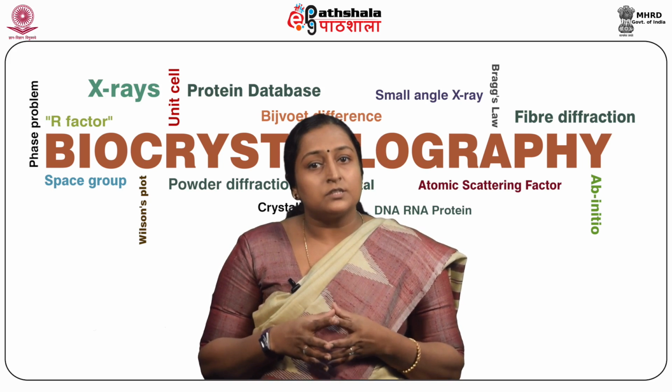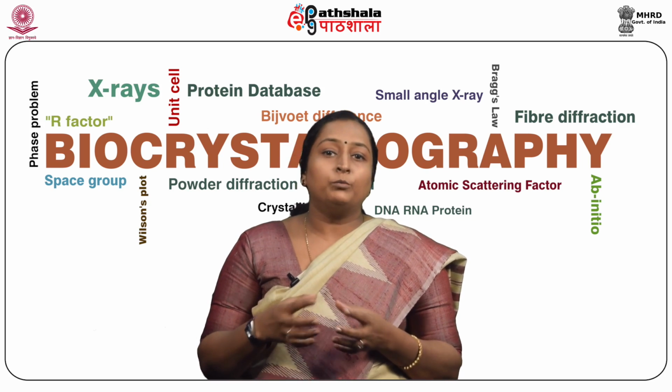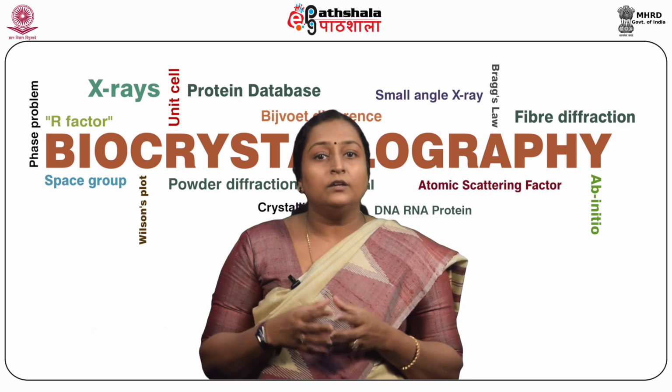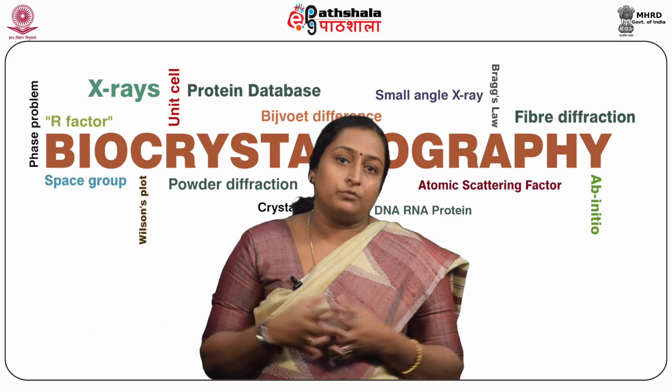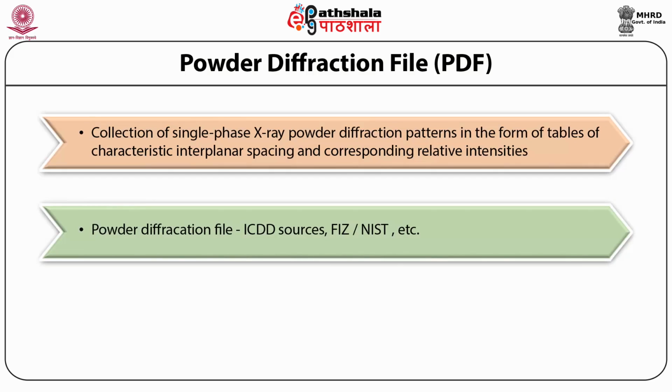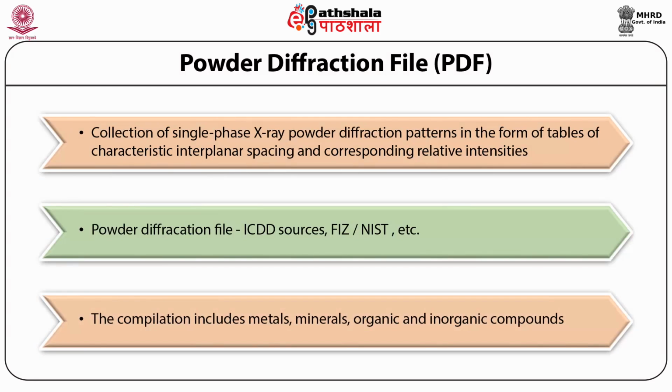International Centre for Diffraction Data is a non-profit scientific organization that promotes the applications of materials characterization methods in science and technology by providing different forums for the exchange of ideas and information. Powder Diffraction File is a collection of single-phase X-ray powder diffraction patterns in the form of tables of characteristic interplanar spacings and corresponding relative intensities, along with the physical and crystallographic properties of the particular molecule. PDF includes data originating from ICDD sources and also from collaborations with ICDD, FIZ and NIST. The compilation includes metals, minerals, organic and inorganic compounds.